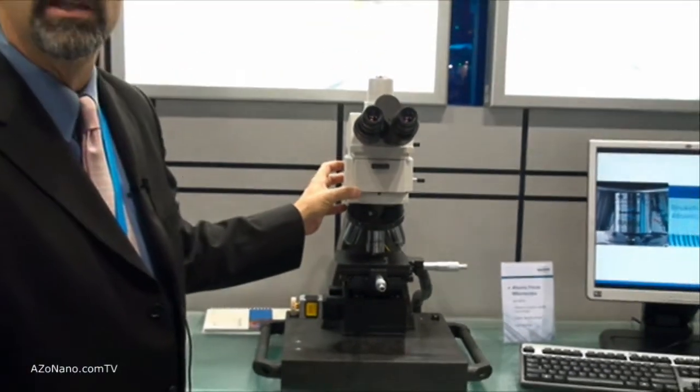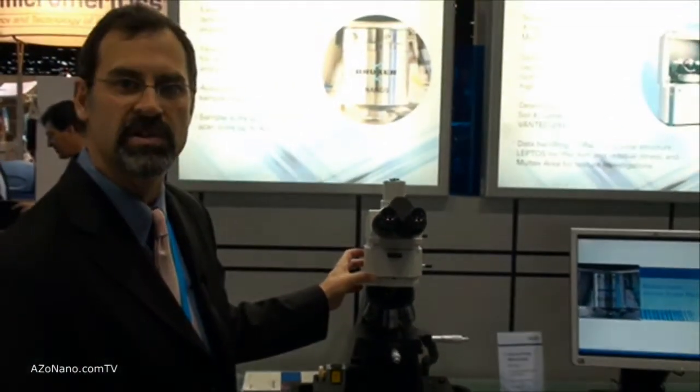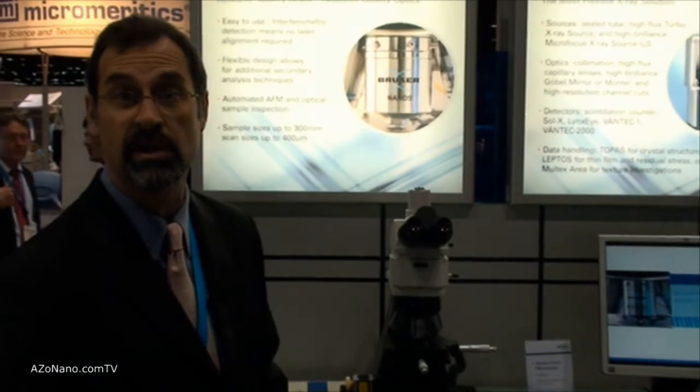We take this model and we can scale it up depending on your needs for sample size, all the way up to a 300mm tool.